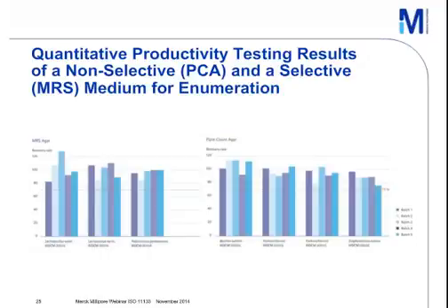Plate count agar was tested here with 4 different microorganism test strains, 2 from Escherichia coli, 1 from Bacillus subtilis, and 1 from Staphylococcus aureus. Plate count agar is tested again, compared against the previous validated batch of plate count agar itself, and has to reach also 70% recovery rate.